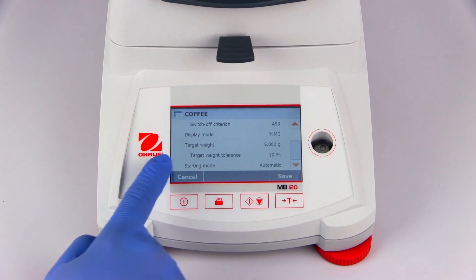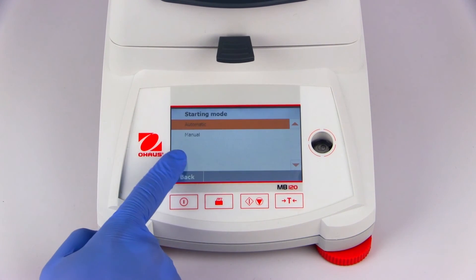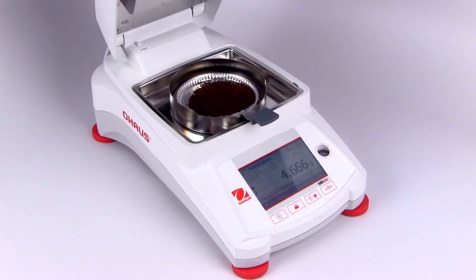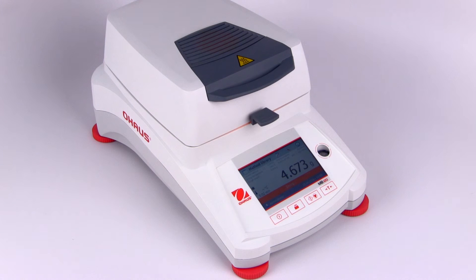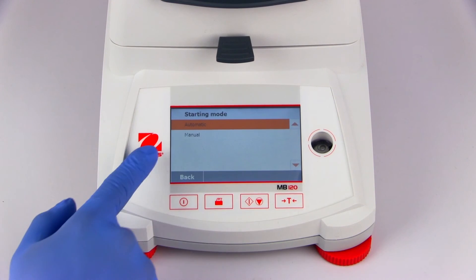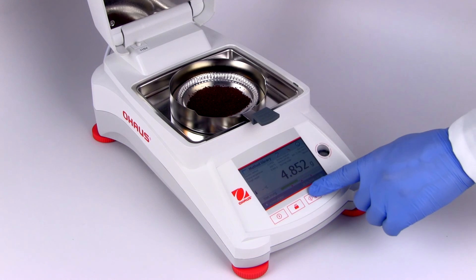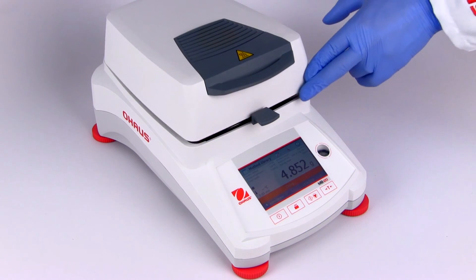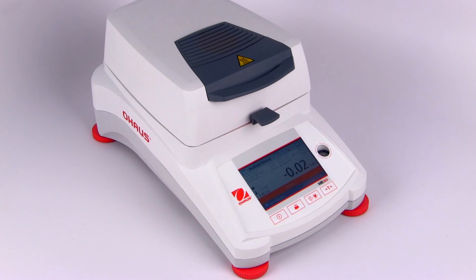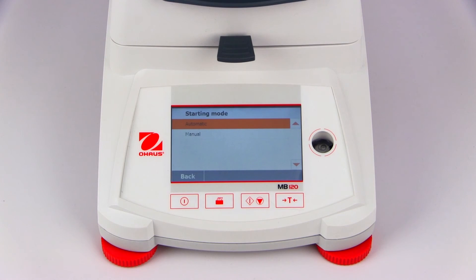Automatic start mode is the most common and will instruct the user to place and tare the pan, place the initial sample, and will automatically start the measurement once the lid is closed and an initial weight is successfully taken. Manual start mode will allow the user to place a sample and press the start button to take an initial start weight and begin the measurement process. This can be helpful when handling volatile samples, where an initial weight must be taken as soon as possible and under controlled stability conditions.